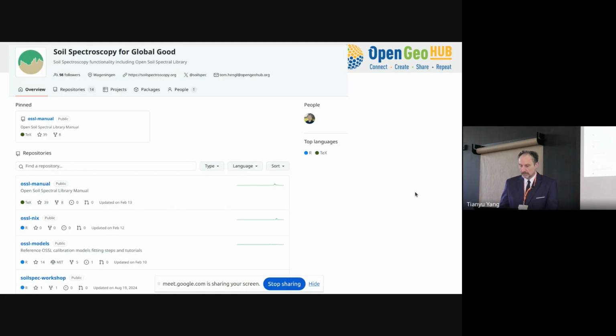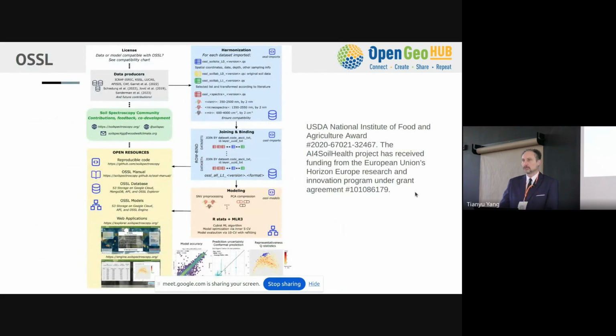It is also a GitHub project, so all the software we make, also manuals, tutorials, models, and workshops we do, it's all on GitHub, usually under MIT license or CC BY license. So if you're a business, you can also use it for commercial purposes. You don't have to contact us. You only have to mention that it's the OSSL library.